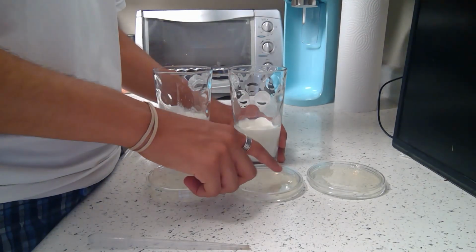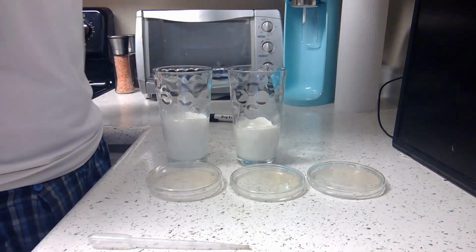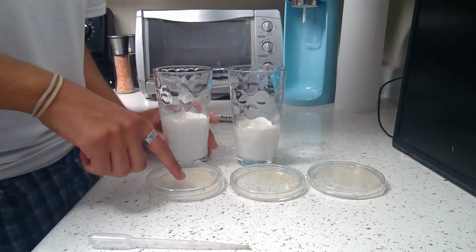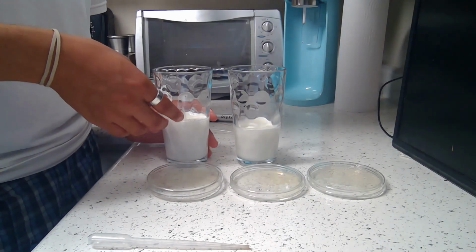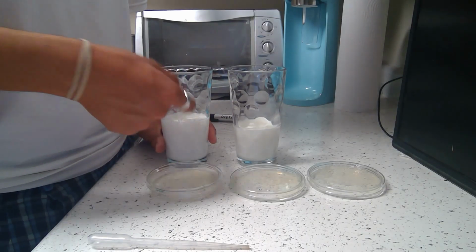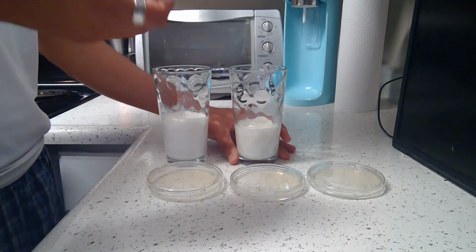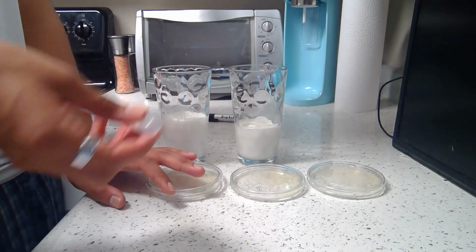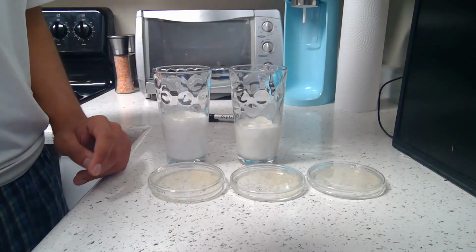The next dish will have the safe to drink, perfectly regular milk taken right from the fridge. This will show how much bacteria is in regular consumable milk that is safe to drink. And this one will have the milk with high amounts of bacteria already grown in it, as seen by the clumps formed in it already. This one, I will remind you, was left outside all day in the hot summer heat. And I will remind you again as well that I will pour quickly and keep these lids on as much as possible to minimize the risk of contaminating it with bacteria from the surroundings. Here we go.